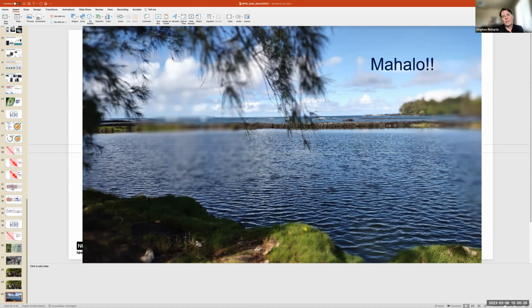Yeah, that's the thing. Maybe we need to talk internally, but that's the kind of question I think might be the harder bit. Again, we've discussed doing some population analysis using short read sequencing, given that much of it seems to be around huge inversions and nested inversions. That's easy to see. It does not have to be extremely deep because they're so big. So just back to that discussion.